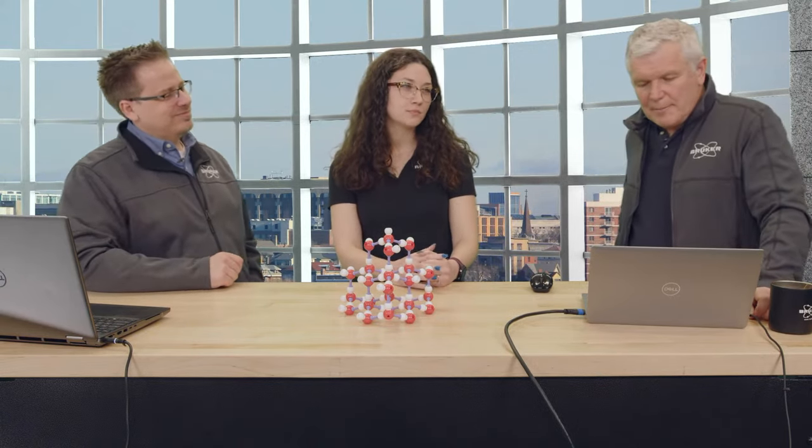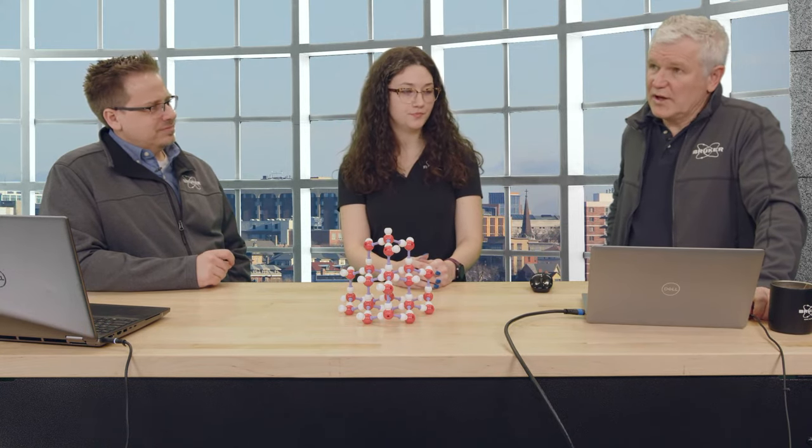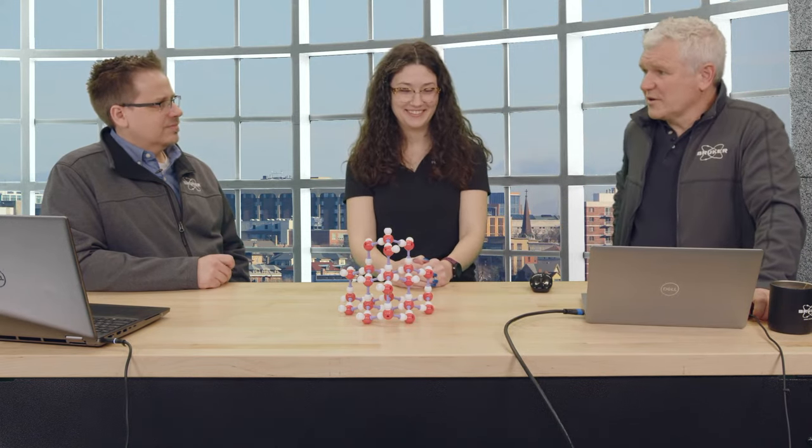You can do composite structures too, but it's not readily supported in Apex 5. The SAINT itself, the integration program, that's the important thing. You will have to set this up manually, sort of. Apex will provide you with a framework, but then you will have to make manual changes, and you can handle composite structures too. Those composite structures also cause satellites and mayhem. They are even more difficult, in my opinion, and typically I walk away and pretend I didn't listen.